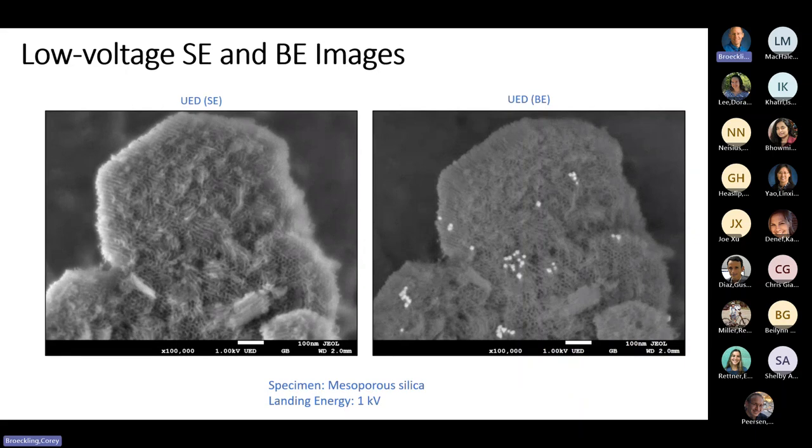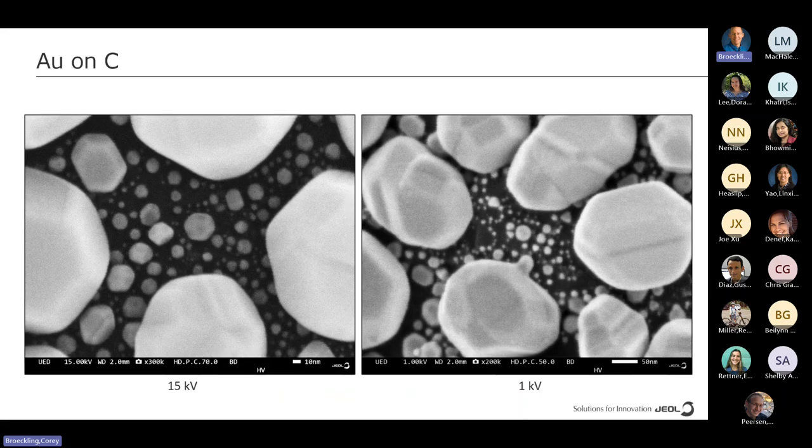Here's another thing. It's really interesting that they have a secondary and the backscattered image at 1 kV. What's interesting is you're getting a backscattered image on the right at 1 kV. That's not normally available because the detectors weren't sensitive maybe to 5 kV if you're lucky. So this is 1 kV. Low voltage imaging, you can do your secondary and you can do your backscattered. Backscattered imaging is Z imaging, so as you change atomic number, you can sort out particles with higher atomic number pretty nicely.